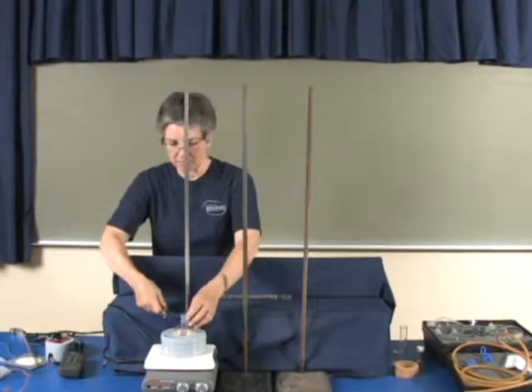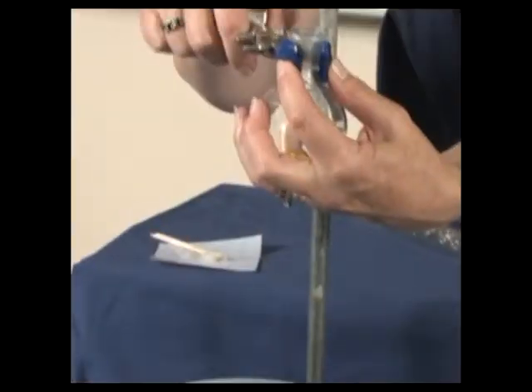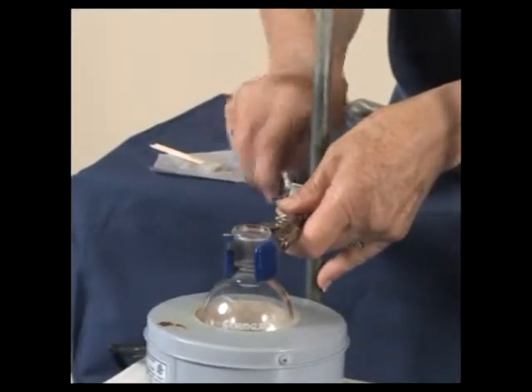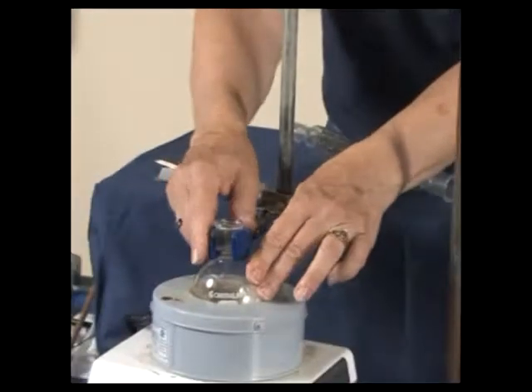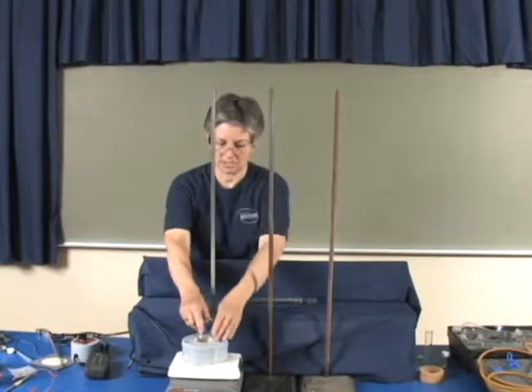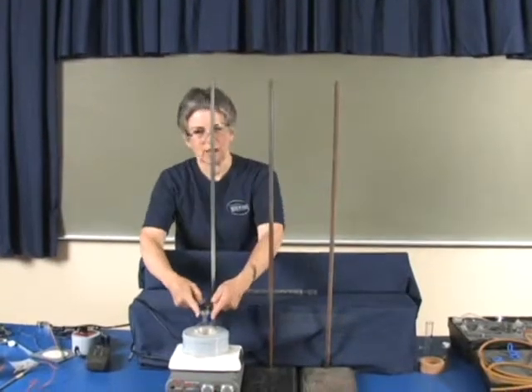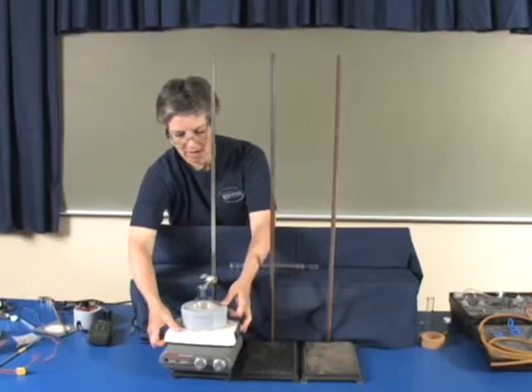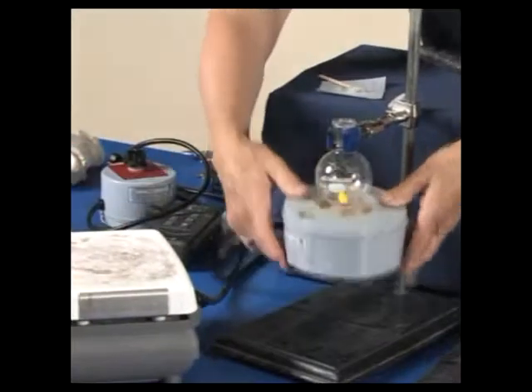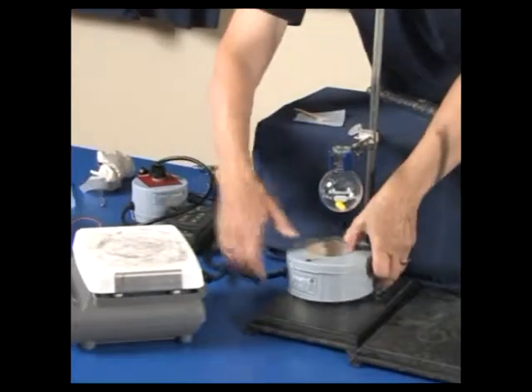The first clamp on the round bottom flask must be a burette clamp, so there's equal pressure on both sides. And this is the most important clamp of the entire setup. This is the clamp that secures everything. The reason this clamp has to be so secure is because if something goes wrong and you need to have an emergency shutdown, you have to trust this clamp because you pull the hot plate out, drop the heat source, and this clamp is required to hold everything else, so it must be secure.